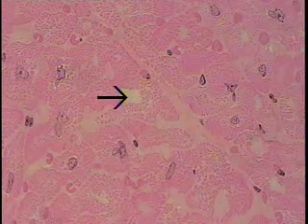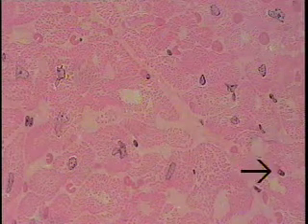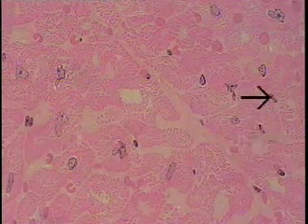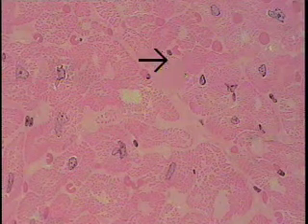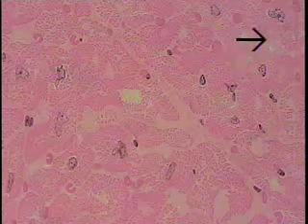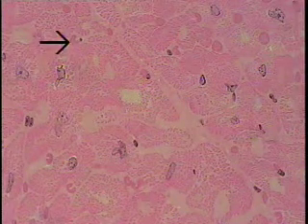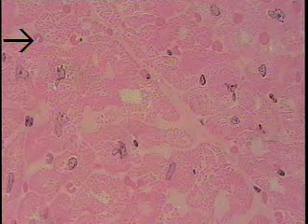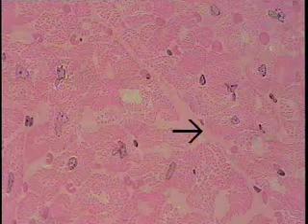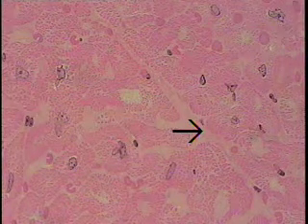of that cardiac myocyte. Once again, the dark, smaller staining nuclei are those of endothelial cells in this very vascular tissue. And if one looks very carefully, one can see a few scattered erythrocytes or red blood cells within this vascular network of this particular tissue, which is to be expected, of course, due to its very vascular nature.